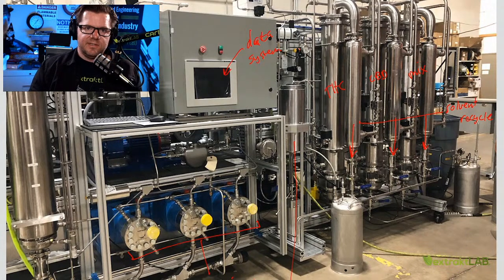So if, for example, THC and CBD, they both really absorb well at 220 nanometers. So typically part of the method would include a 220 nanometer UV detection. And that would be this detector right there.